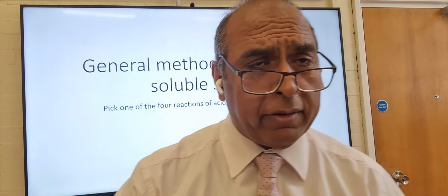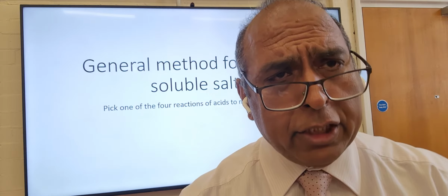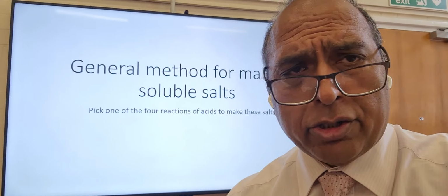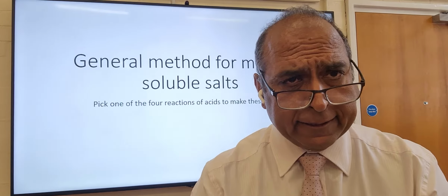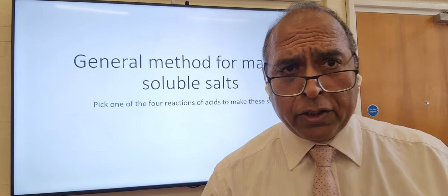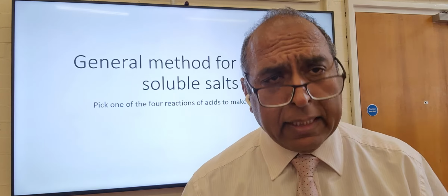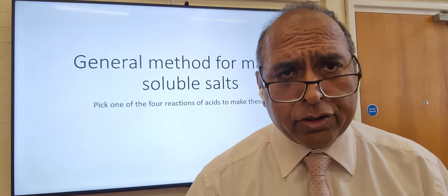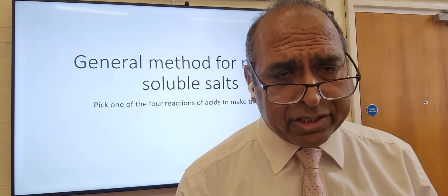And before I carry on, remember this method is used where we've got salts that are soluble, salts that dissolve. Precipitation, which was my last video, dealt with insoluble salts, salts that don't dissolve. This one deals with salts that do dissolve. And you've got to pick one of the reactions of acids.